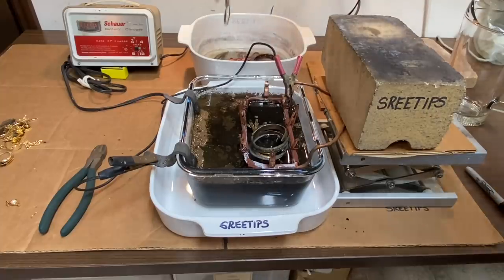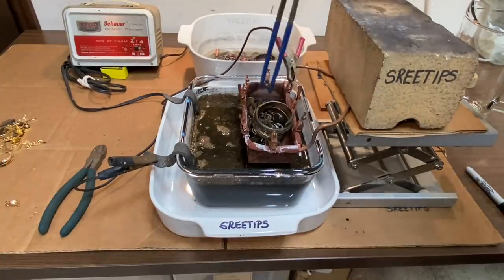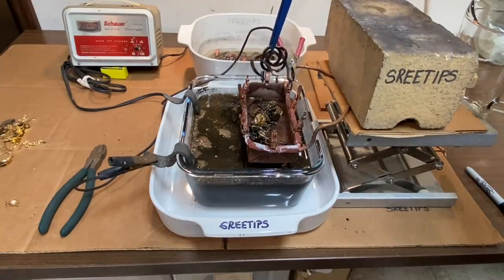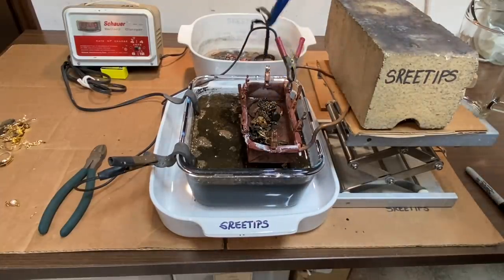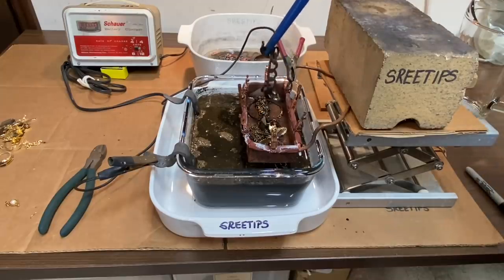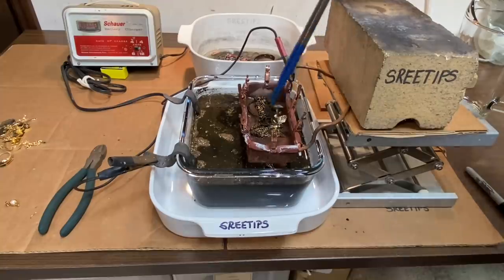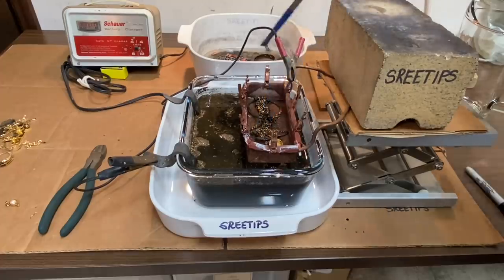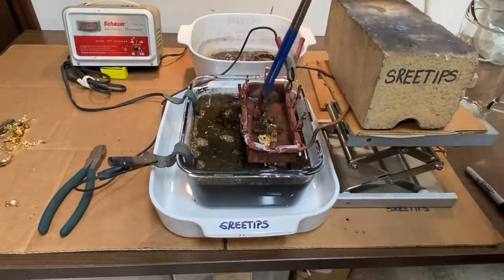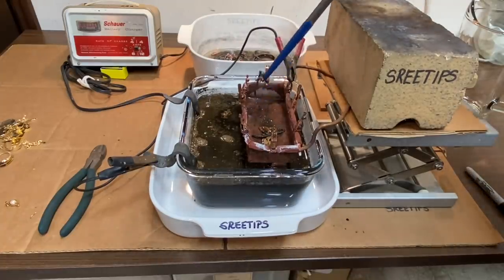Someone made a suggestion about storing the anode basket in a bucket of water, adding a spoon of baking soda to neutralize any trace amounts of acid. And because the basket is very fine mesh — we could probably get by with a little thicker mesh — but it's held up well so far. That's a good suggestion: put a little baking soda in with the basket as it spends the night in the water.